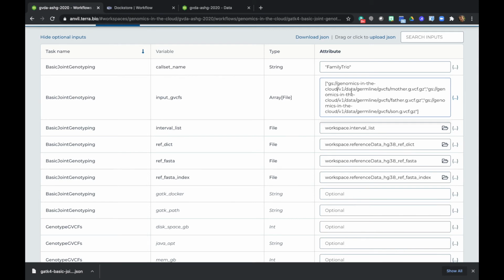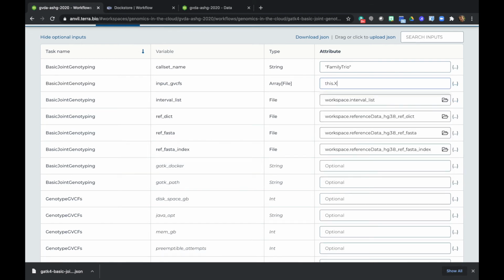Because this time we need to point to just one of many columns in the sequencing data table, effectively telling the system, for each row in the table I'm giving you, the input you want is in column X. And so the keyword for that is this.x, the syntax. This.x, right? X is a placeholder.